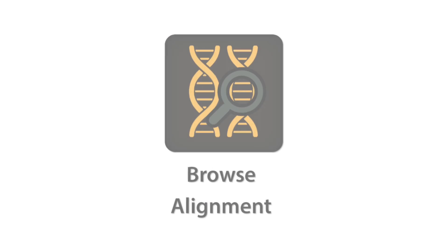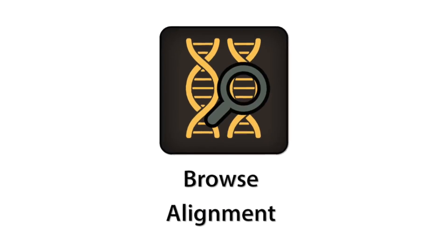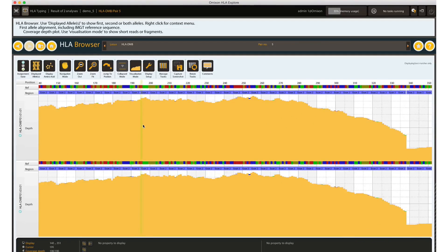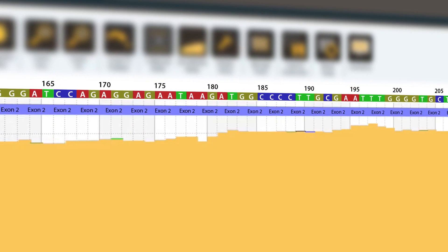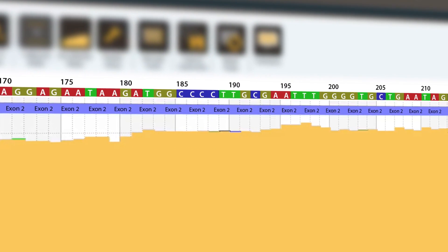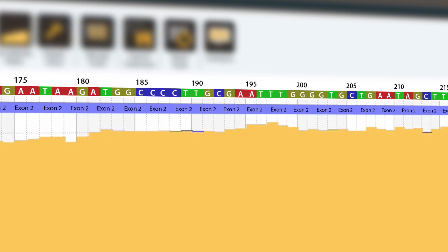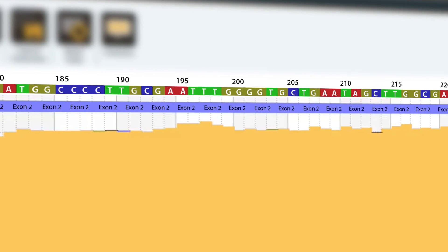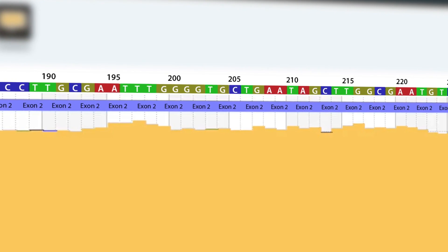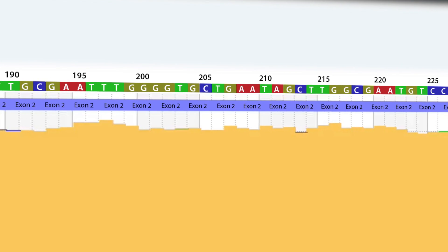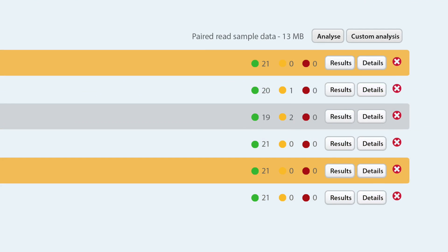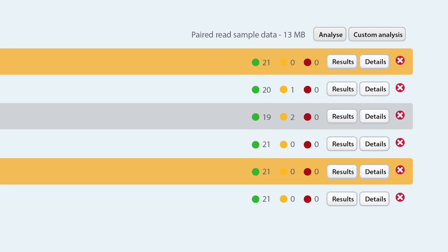With the Long Read module, you can analyse sequence data covering several kilobases, which has the potential to ameliorate many of the challenges associated with phasing and even haplotyping with the appropriate capture method.